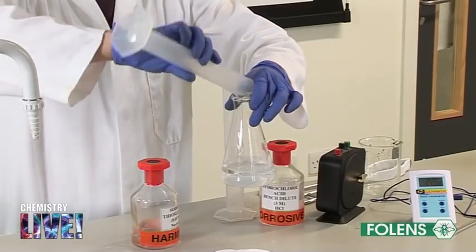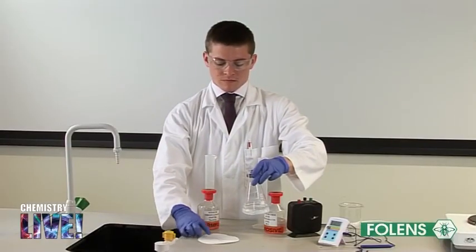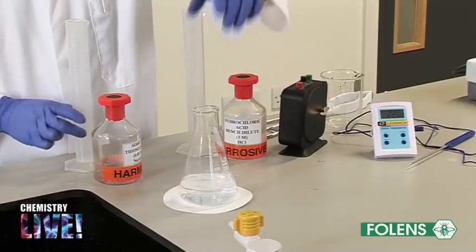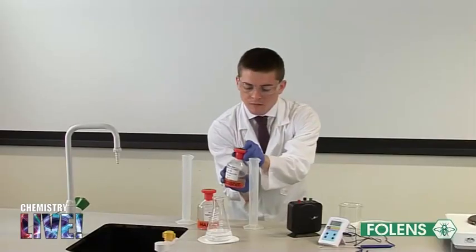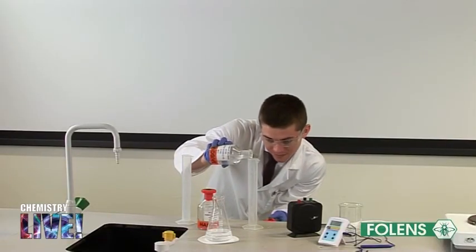Place the conical flask on a sheet of white paper on which a mark has been made. Pour 10 centimeters cubed of the hydrochloric acid solution into the conical flask.